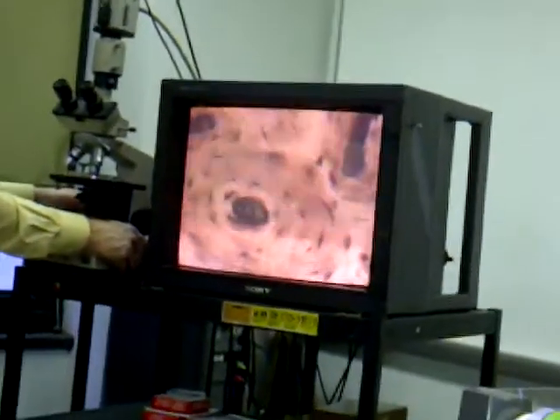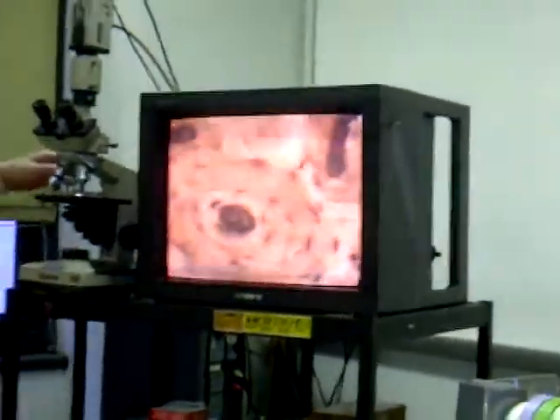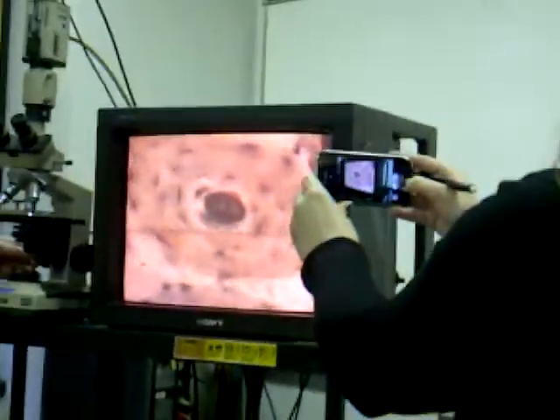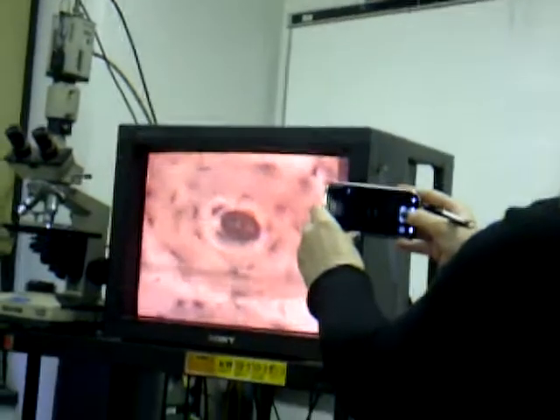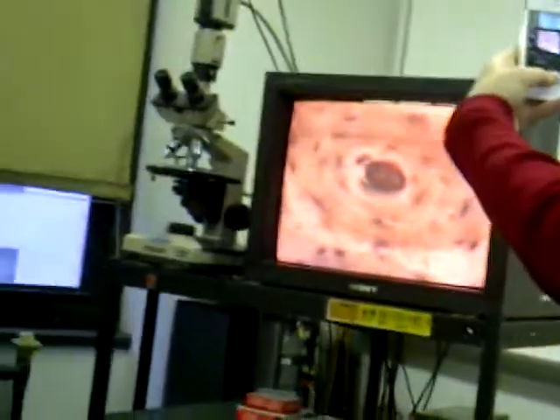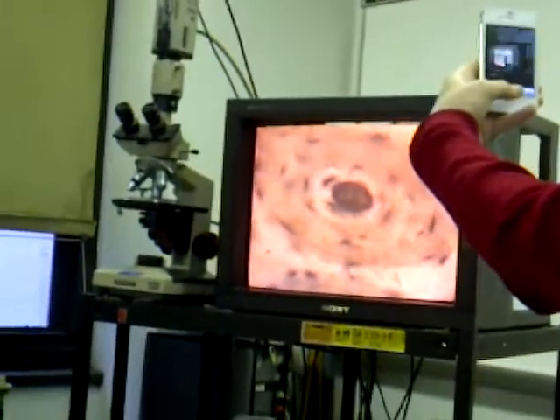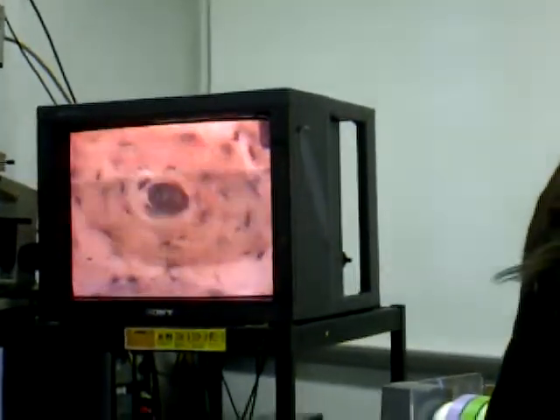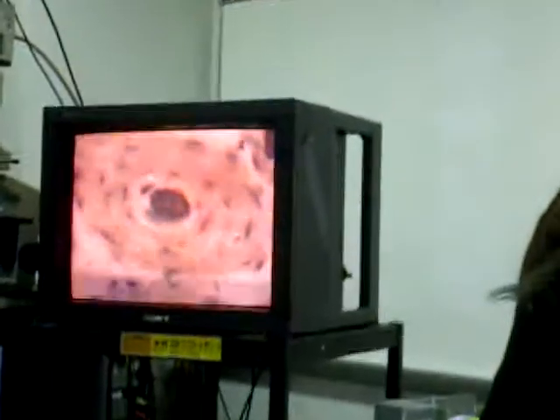Okay, so if I asked you what was the tissue type, you would say compact bone. The tissue type here is compact bone. That's what you find organized in this geometric way, where the structural unit, which fills most of the field, is called an osteon. So the structure that fills most of the field is an osteon. The tissue type is compact bone.